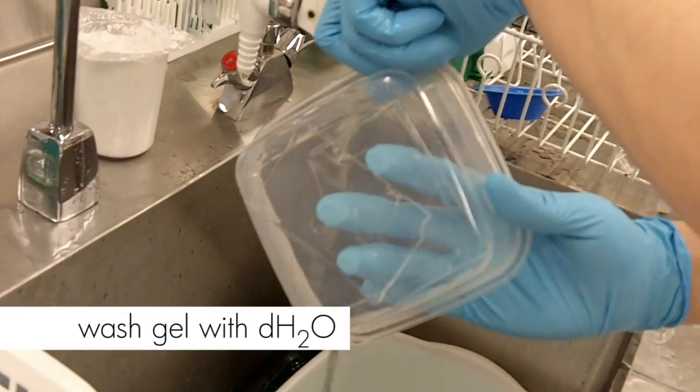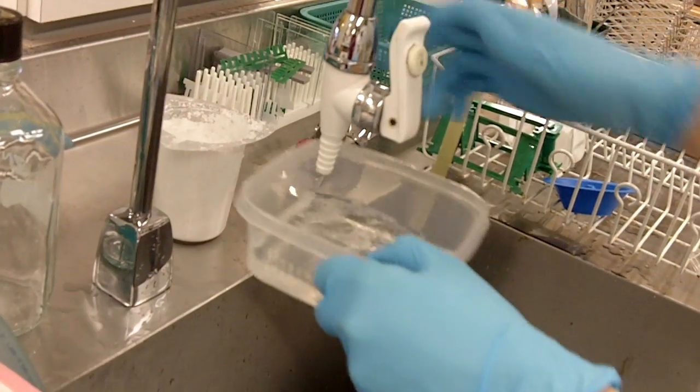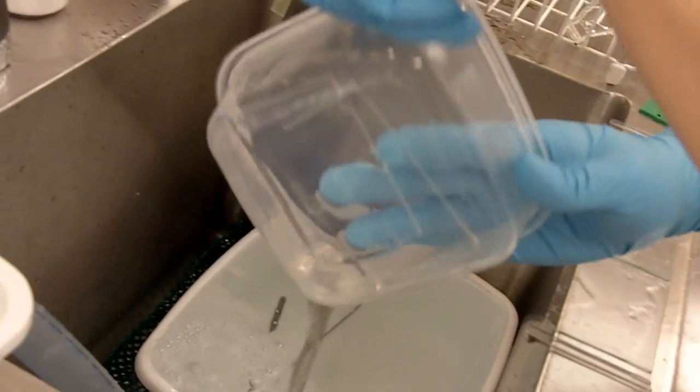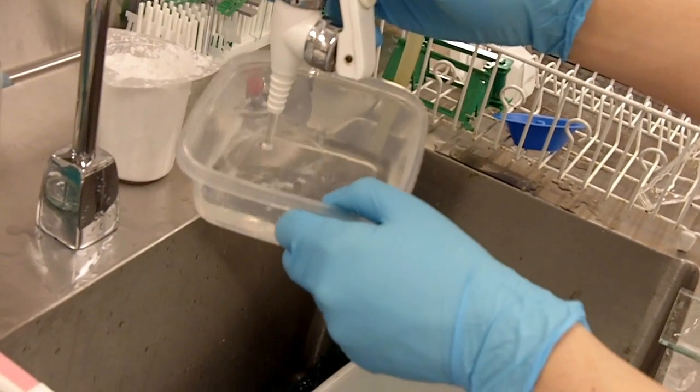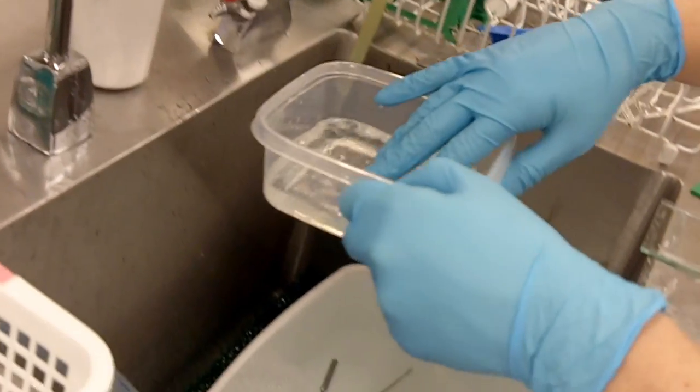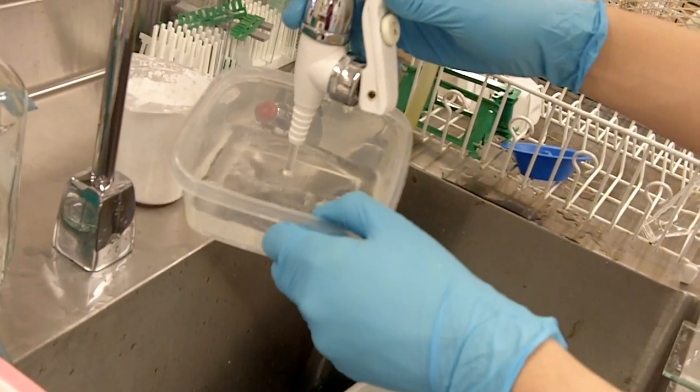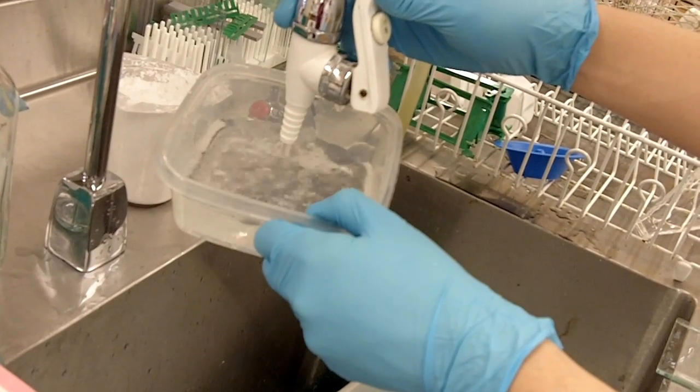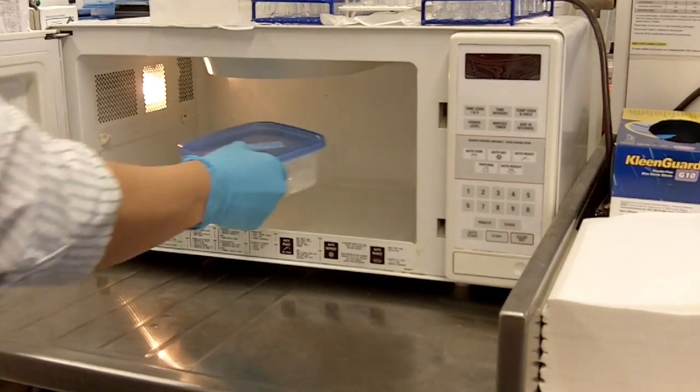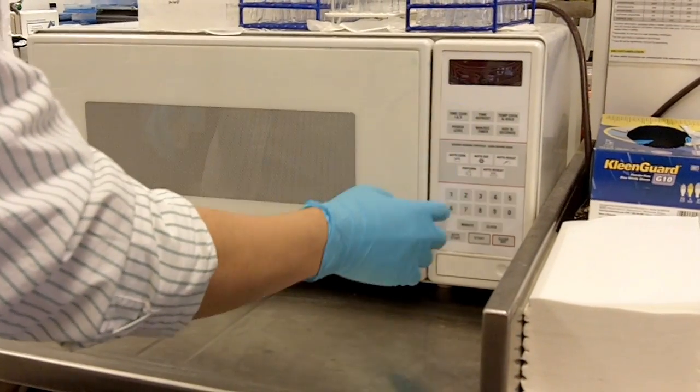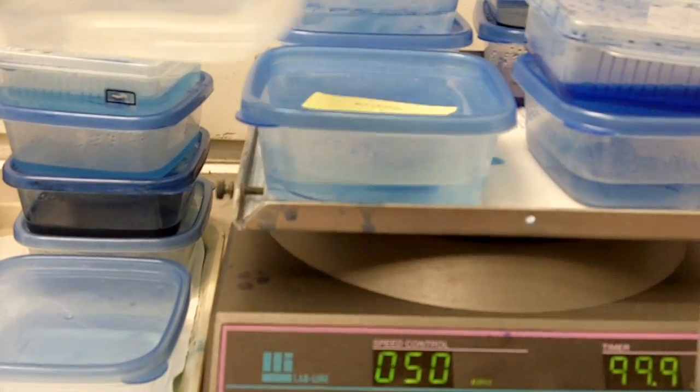You want to wash your gel a few times with distilled water. Make sure you put the water in gently so it doesn't break the gel. When you pour the water, hold on to your gel with your finger so it doesn't come out and break into the sink. Before you microwave, we want to fill up the container with water and we'll microwave it for about a minute, and we'll let it shake on the shaker for five minutes.